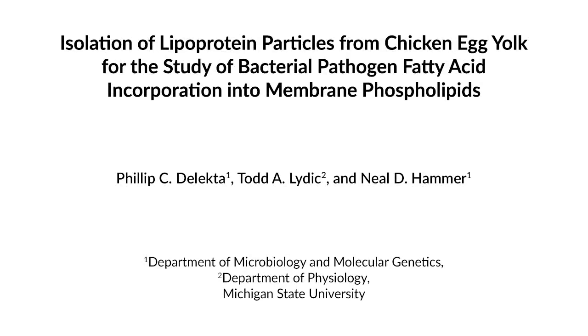This protocol provides a framework for studying the incorporation of exogenous fatty acids from complex host sources into bacterial membranes, particularly Staphylococcus aureus. The protocol utilizes unbiased lipidomic analysis and lipoprotein particles isolated from chicken egg yolks as an economical source of complex fatty acids to quantify fatty acid incorporation into bacterial lipids.